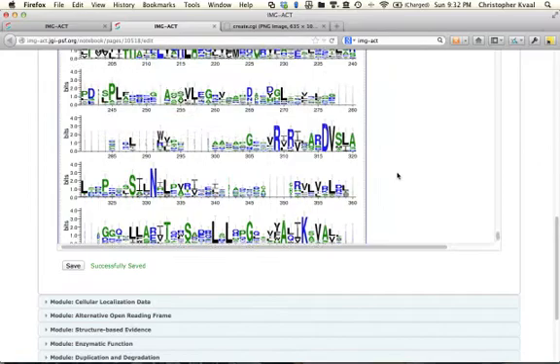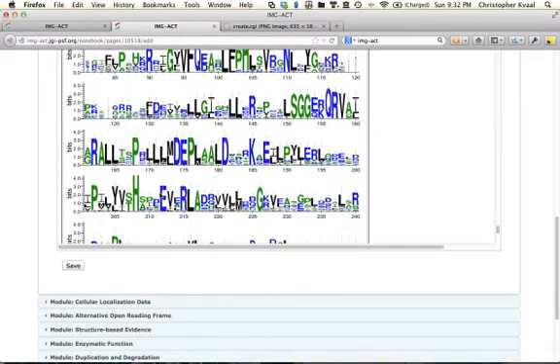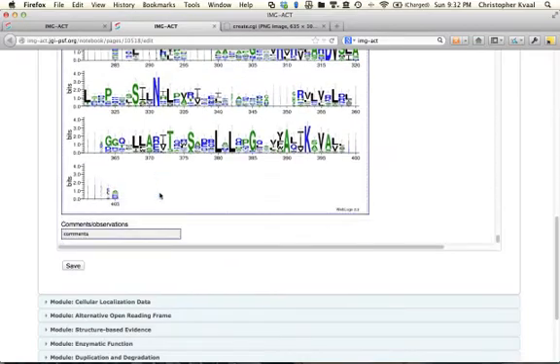And so what are we going to write about this? Well, the beginning of this protein looks a little bit odd because there's a capital M and there's a big nothing otherwise.